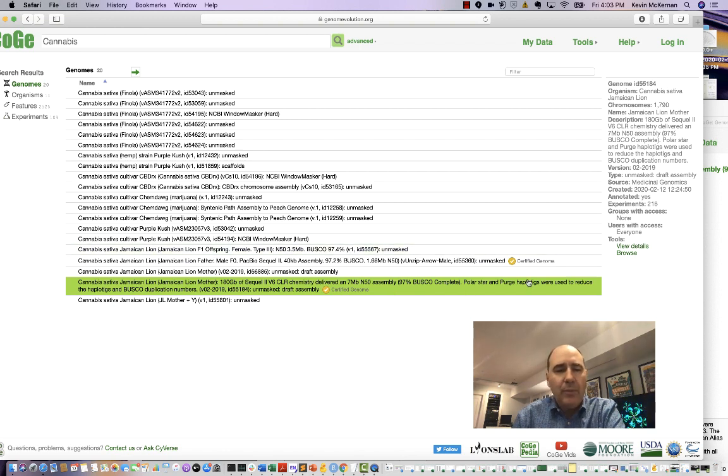You will note we have not put them into chromosomes yet. While we are playing with that, we're cautious on calling the chromosomes because they're all very similar sizes. And as we just showed you, there are frequent 2 megabase deletions that may make you miscall chromosome 5 versus chromosome 6 because these things are really close in size. And when there's a 2 meg deletion there, you can quickly mistake chromosome 6 for chromosome 5. I'm not saying they're on 5 or 6. Just as an example, a lot of these chromosomes are almost identical in size, and so the deletions matter.